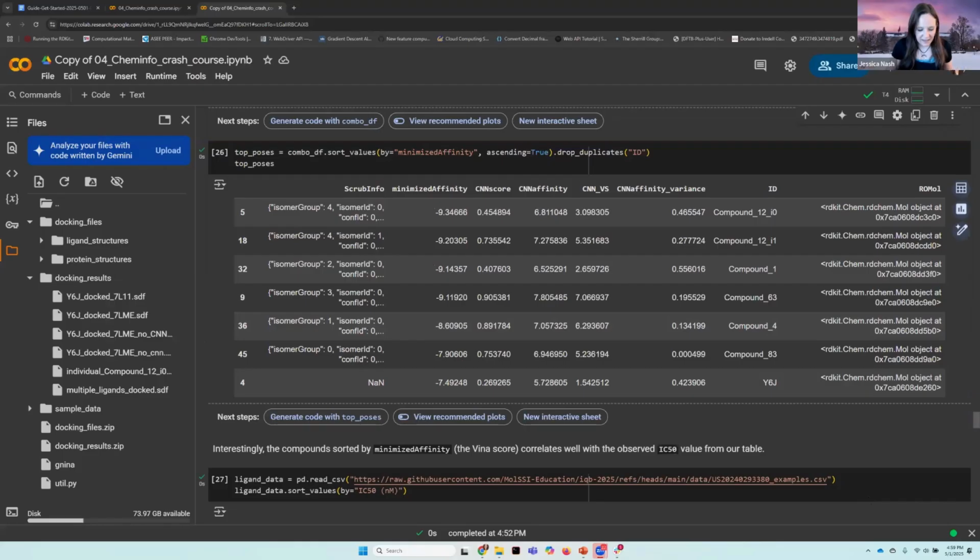Right, and I'll also say that for a workshop setting, the type of docking that we can do is also very limited. We already saw that when we're doing docking of one structure, we're waiting like 3 minutes. Then there's also flexible docking that you can do, but there's also this concept of ensemble docking that we didn't talk about here. That is where, instead of doing flexible docking, where you allow your side chains to be flexible, you may have several conformations of your target receptor.